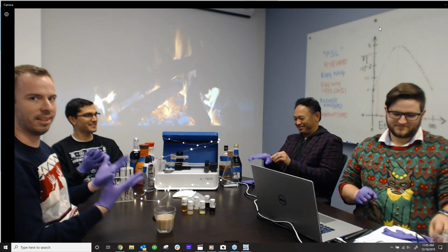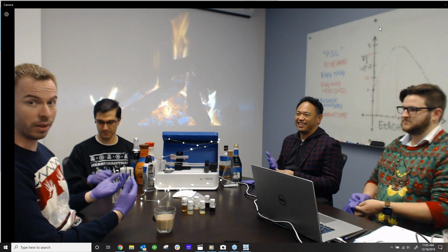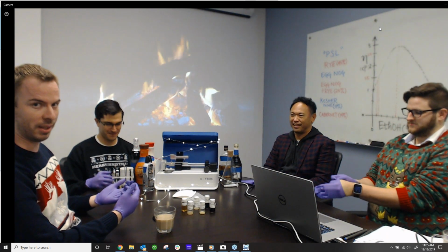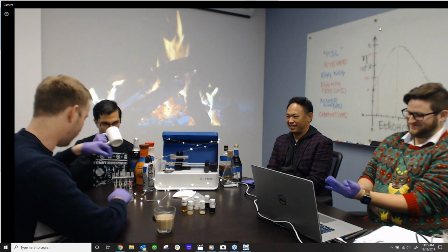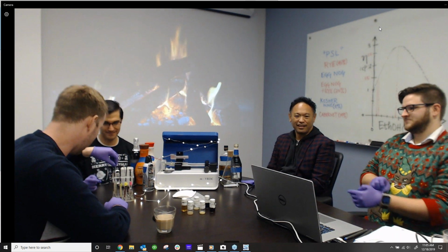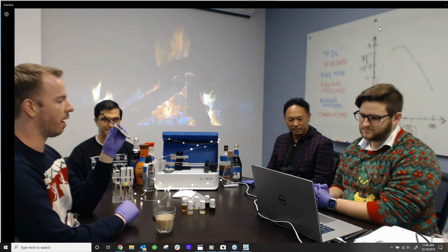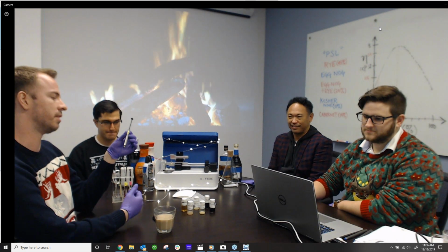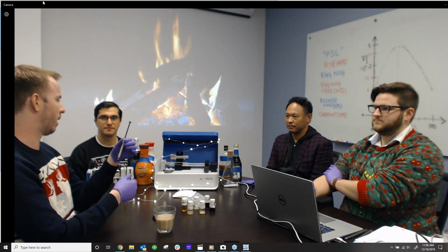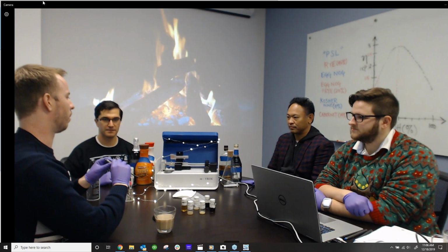All right, so now we're ready to go. As Stacy was saying, the first beverage that we're going to be testing today is pumpkin spice latte, more commonly known as a PSL. So here it is, the PSL. As Stacey was also saying, we did filter these, so it's not going to be the exact composition that you would find in the bottle. With that in mind, we'll go ahead and start loading it.